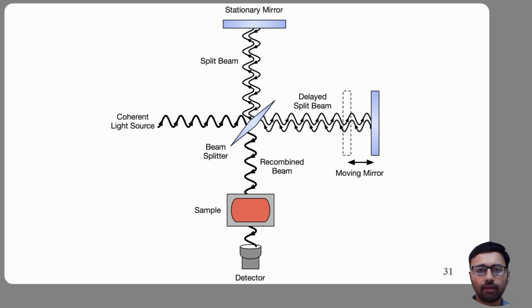In our next lecture, we will continue exploring FTIR instrumentation and examine how modern single beam and double beam FTIR spectrometers are constructed and operated in real analytical laboratories.